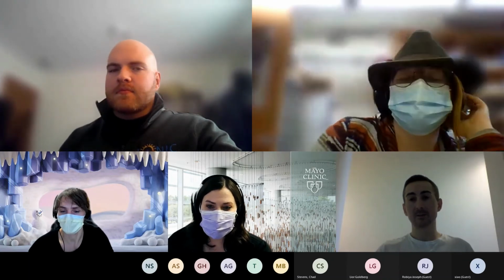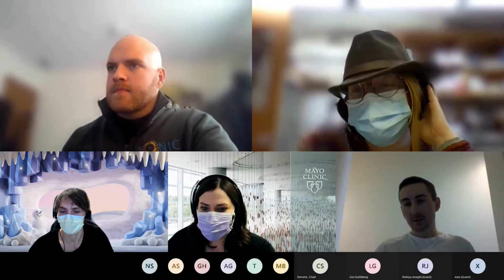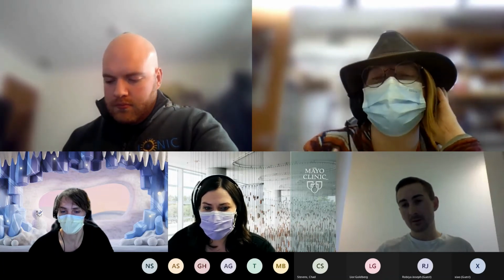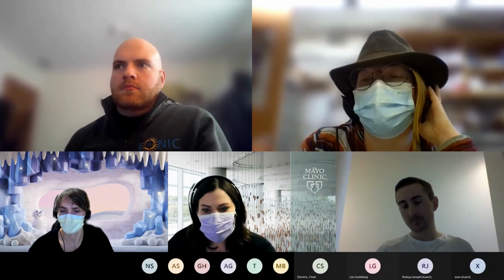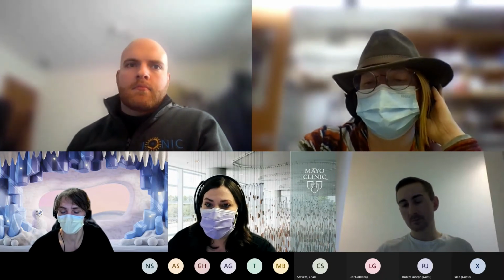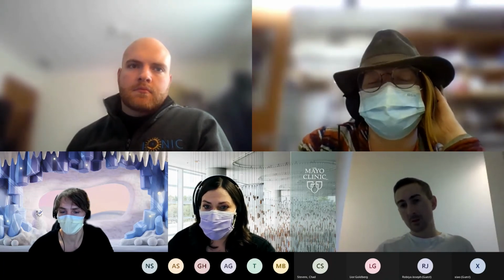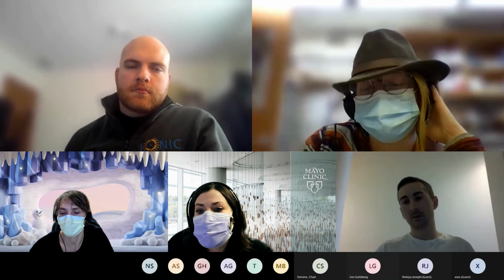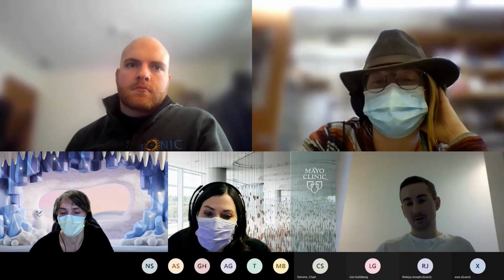I have a comment. I know that if you stain your samples and then store them, one thing that can happen that may increase your signal is that proteins are flexible. When we think about molecular modeling of proteins, oftentimes you forget about all the water that's in between. When you freeze, the change in orientation that happens because of the condensation can allow some epitopes to be more available. It also works in the reverse way. Sometimes if you freeze, those epitopes aren't as well exposed and you get a decrease in signal. So that can contribute as well.